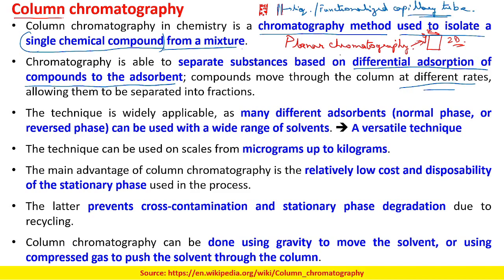When we talk about differential adsorption, if you remember in the first case, in planar chromatography, when we applied some analytes, some of them were moving faster and some were moving slower compared to the others.